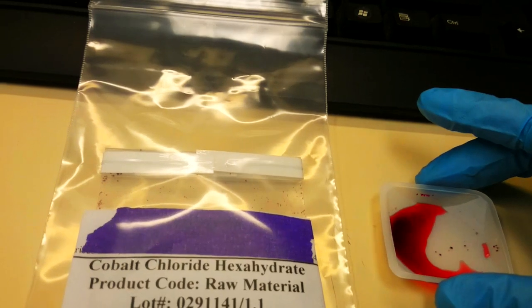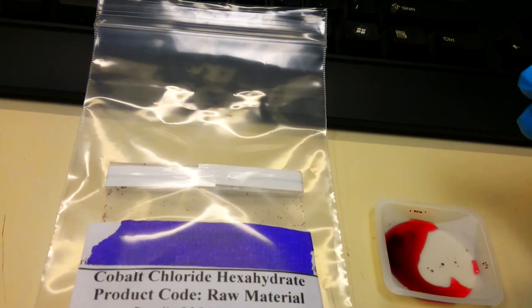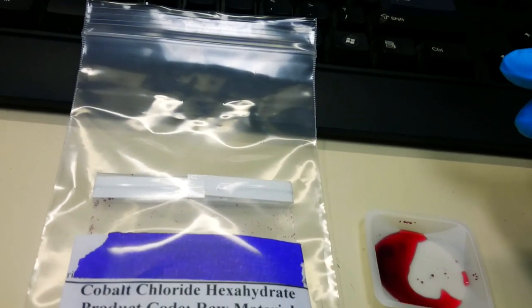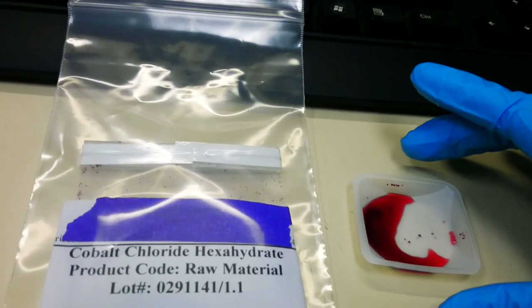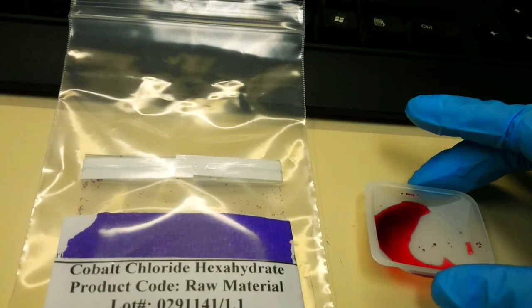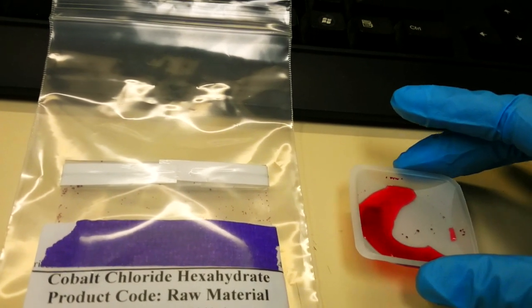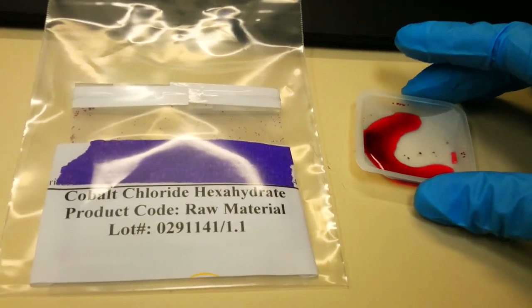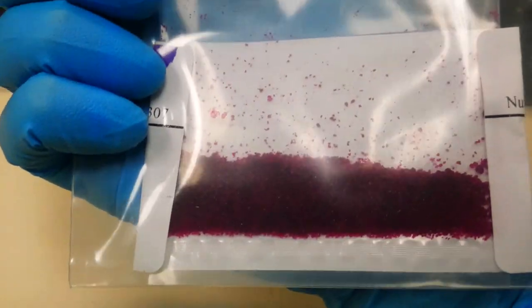So, cobalt chloride and cobalt chloride hexahydrate. From Wikipedia, it says that cobalt chloride is an inorganic compound of cobalt and chlorine. The hexahydrate is deep purple in color, whereas the anhydrous form is sky blue. I would still call it pink rather than deep purple, but that's okay.